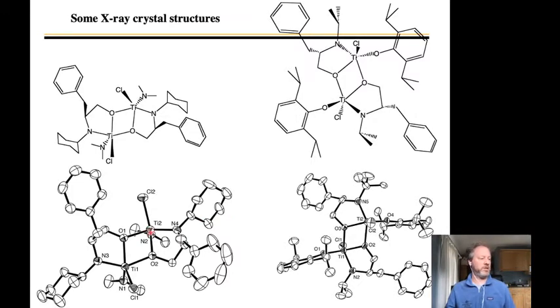And so the titanium has smaller ellipsoids because it's a heavier atom. The carbons that are way out here are vibrating. This carbon is vibrating in this position in the crystal lattice. And so the size of these ellipsoids gives you a sense of the thermal motion. If you have really large ellipsoids, it might mean that the crystal has crystallized in two slightly different orientations, so here and here, and you can then go in and model both of those orientations to get a better crystal structure.